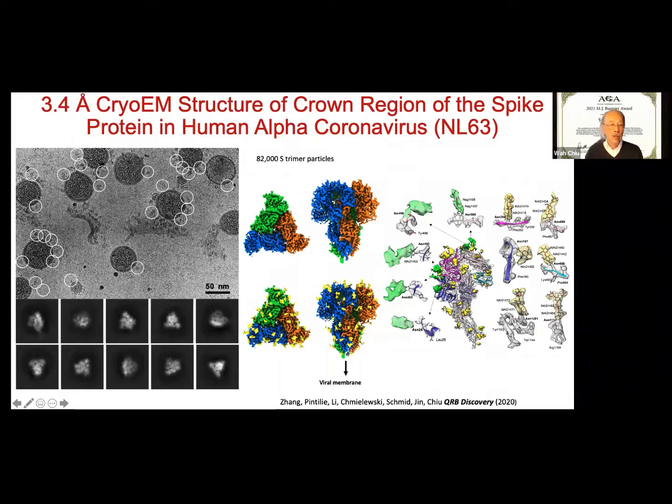And since we are working with the whole virion, based on our structure, we actually compare very nicely with that solved by David Wessler with the expressed protein. He was able to assign the density together with the mass spec data. So we match very well with the assignment.